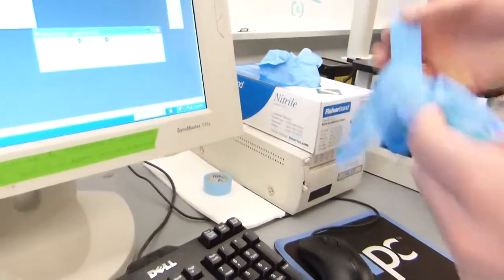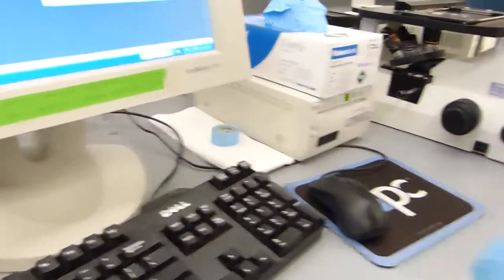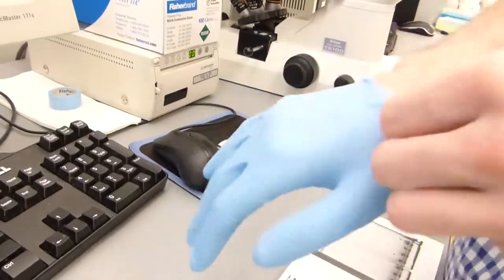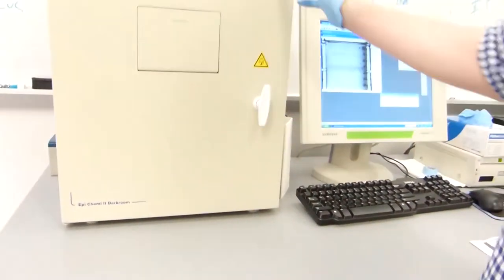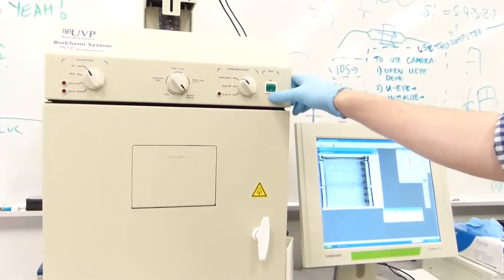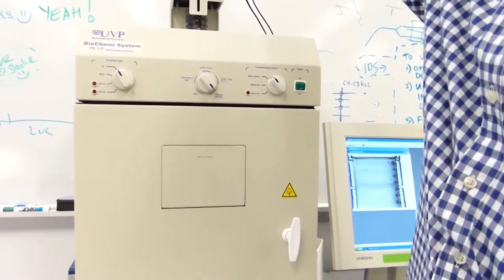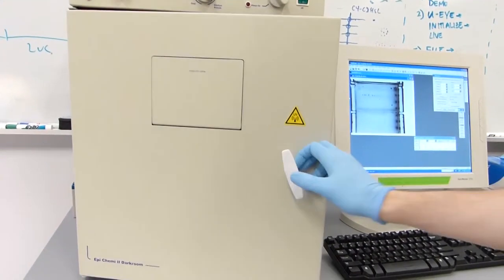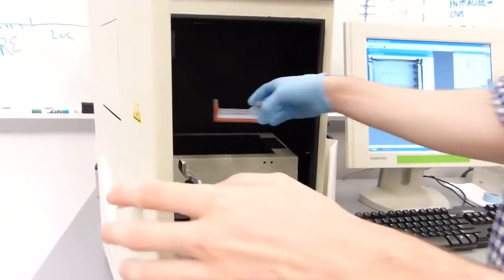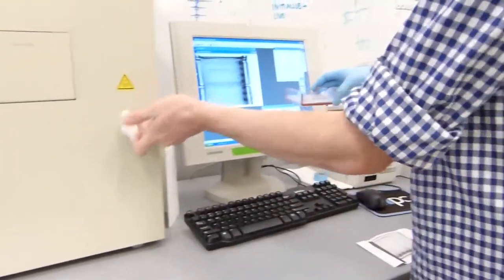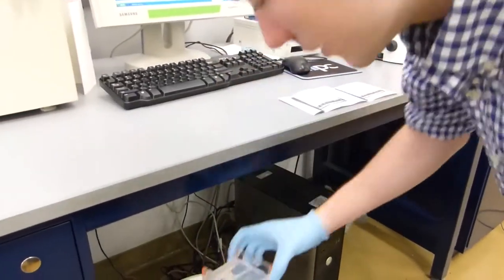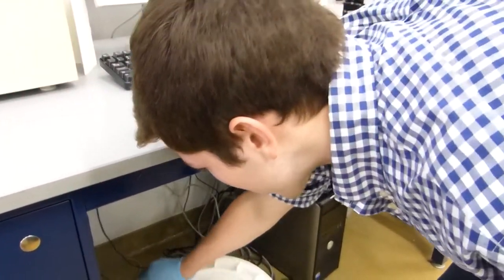After you are done printing, you will want to put a glove back on and then power off the box and power off the camera. From here, you can open the box, take out your gel and dispose it in the appropriate ethidium bromide trash pack.